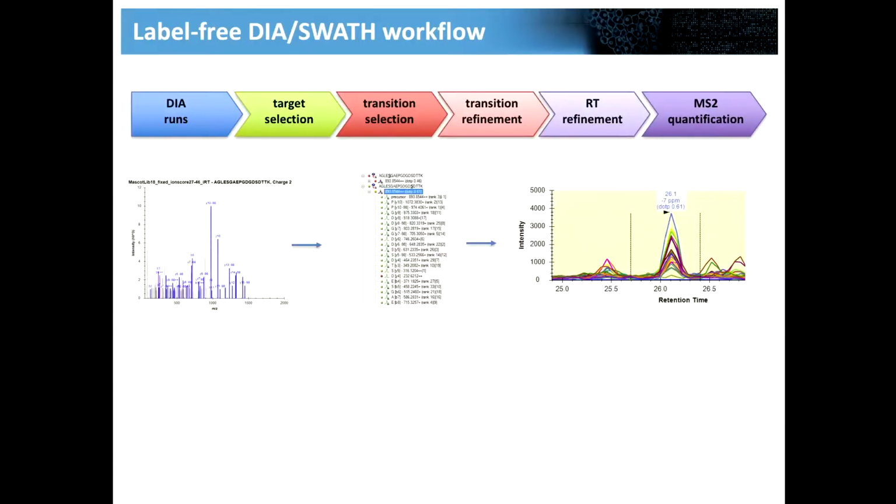Unfortunately, in most cases, we don't have synthetic peptides. Actually, when we're doing most of the DIA SWATH types of experiments, if we're interested in the entire phosphoproteome, then we don't have it all synthesized. So we're likely to be working in the label-free sphere of quantification. And then the workflow that we've been doing so far is we had some spectra that came from some source. We built a spectral library. We selected transitions based on that spectral library. We've just brought to our attention that we should also take into account what type of transitions include those unique ion signatures, and extracted a certain peak, for example, using Skyline. How many people think this is the right peak? I see one.